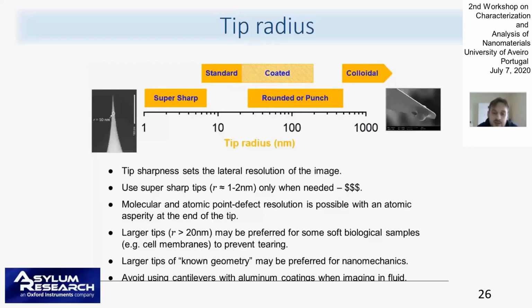This is specifically done to make a wide object because it allows, for example, studying biological objects where you don't need a really high resolution, but you should be careful not to damage the cells, because if you are measuring living cells especially, it may change and even kill the cell.